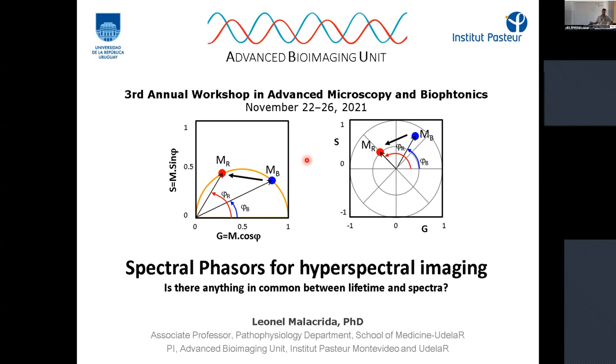And I said, no, Enrico, no way. We don't have any machine to do phasors. And Enrico sat with me and explained to me how to do phasor on hyperspectral imaging. And after that, it was my conversion to the phasors and hyperspectral imaging and FLIM imaging when I joined the LFD.